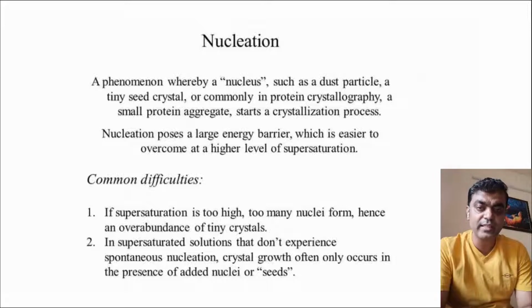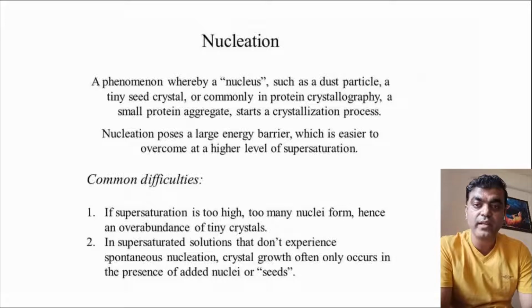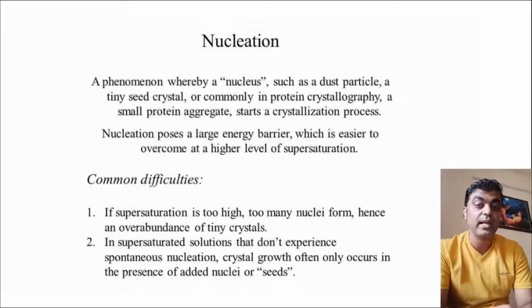The protein is in a solvent, and this is the first step where the crystallization process has started, right? And this is very small. You can see this crystallization, or the nucleation, a protein crystal nucleation, will be comparable to a very small fine dust particle. It is as small as that. It is not a crystal, but the crystallization process has started in the nucleation process.